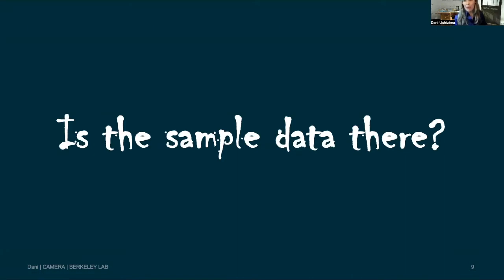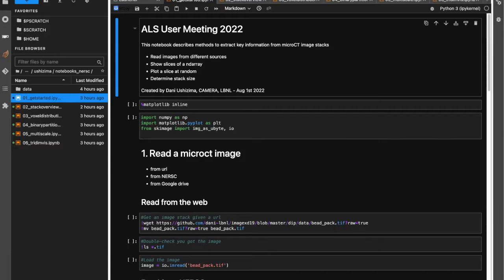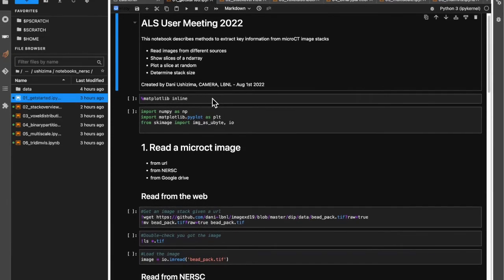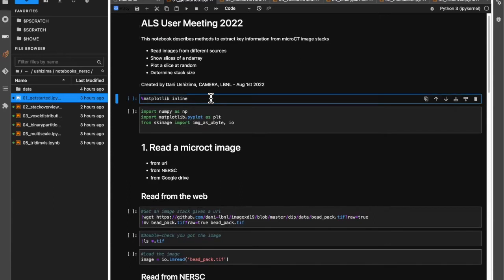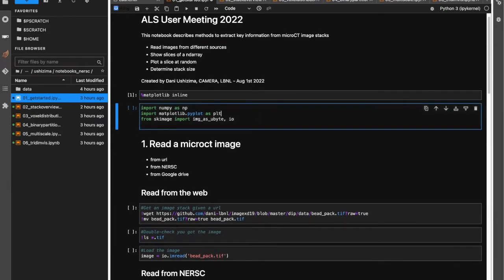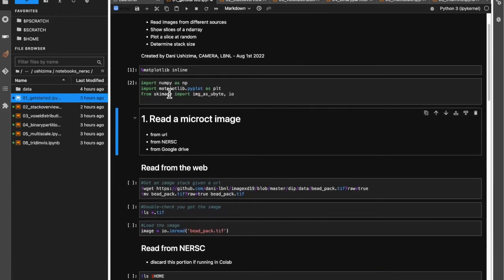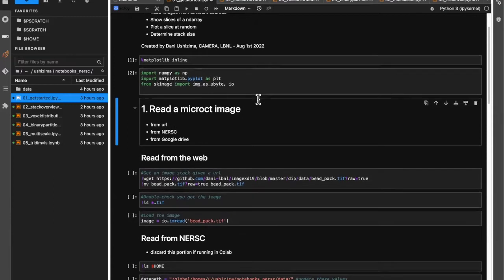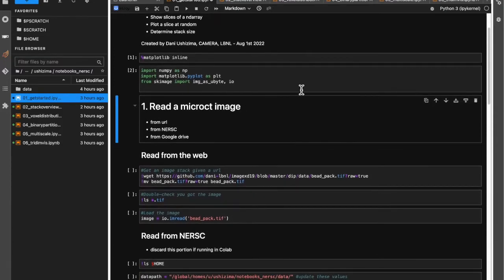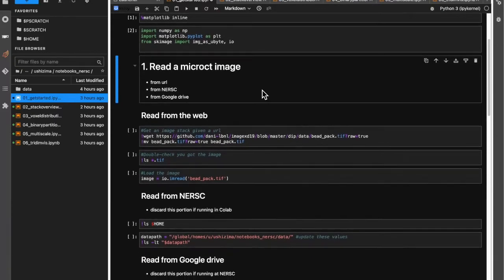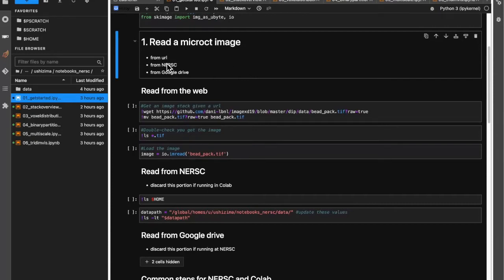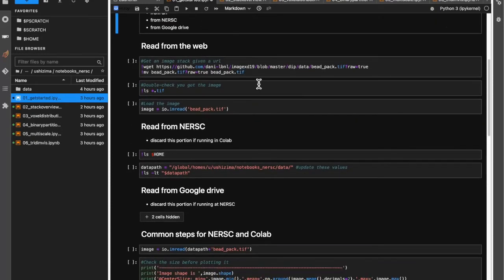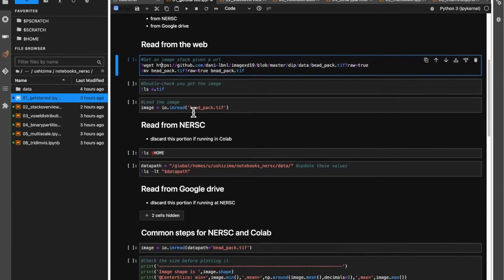Let's check: is the sample data there? Here we go — this is the first Jupyter Notebook. I'm logged in. First of all, you must have matplotlib inline so that you can see the images being plotted in the Jupyter Notebook. Here I'm running and loading all the libraries that will be necessary: numpy, matplotlib, and scikit-image. These are the three packages necessary to run this particular Jupyter Notebook. There are also options to download data using a URL with wget in case you weren't able to upload all the data.